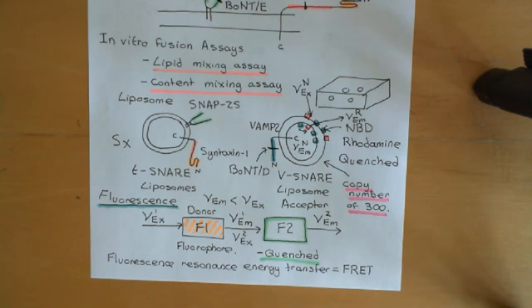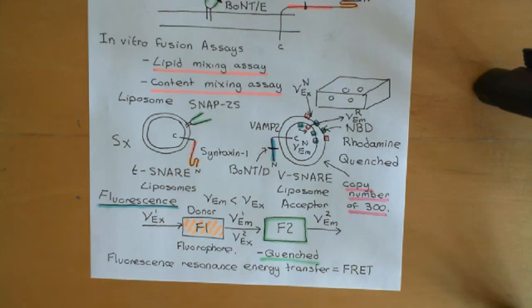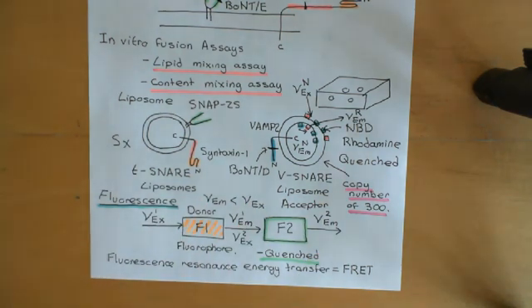But at the same time, what you should also note is that we are lacking loads of regulatory proteins here. We are lacking, for instance, MUNC18, MUNC13, and those other active zone proteins which might be involved in getting the syntaxin 1 ready to form these sort of complexes. So potentially that might explain why you need such a high copy number there in order to get a signal.